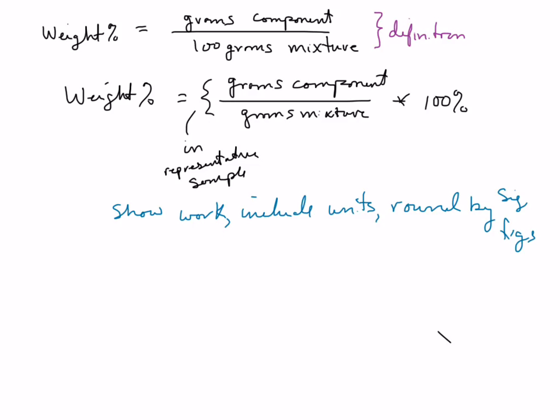So now to get the masses of the components, we are going to do something that is oftentimes done in chemistry or physical science. Before we separate it, we are going to get a tare weight on each of these. There's a place on your data sheets that says basically the weight of the container. So get a good weight on these, write that down, and then see who's the best at separating your eggs out. Now there is a knack, as you probably know, to boiling the eggs so they peel easier. So we'll just see how I did.